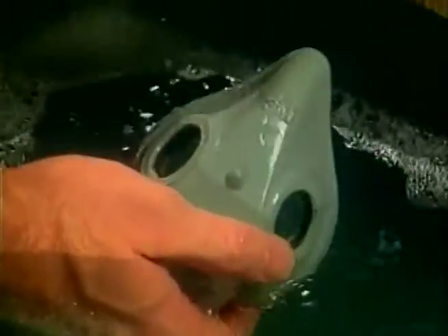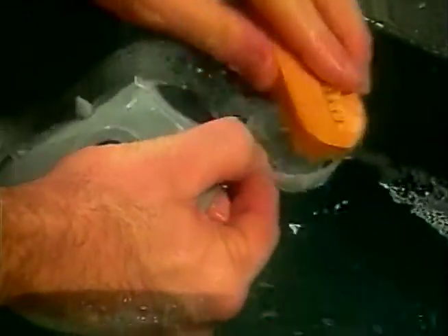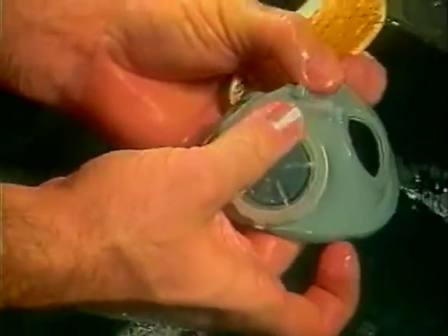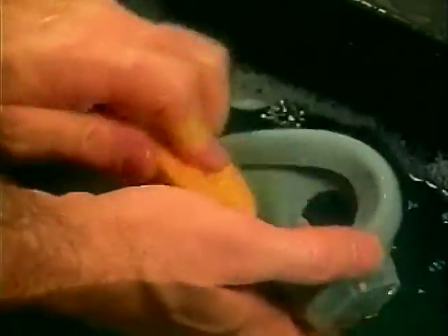Scrub the respirator with a soft, bristle brush. Do not use organic solvents such as thinner, acetone, or turpentine because they would damage the respirator. Rinse the respirator and let it dry in a non-contaminated area.